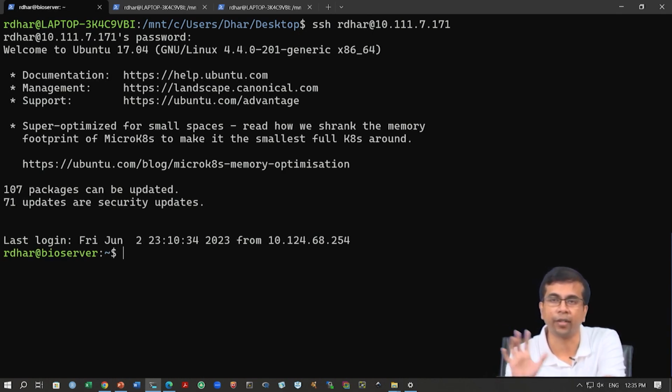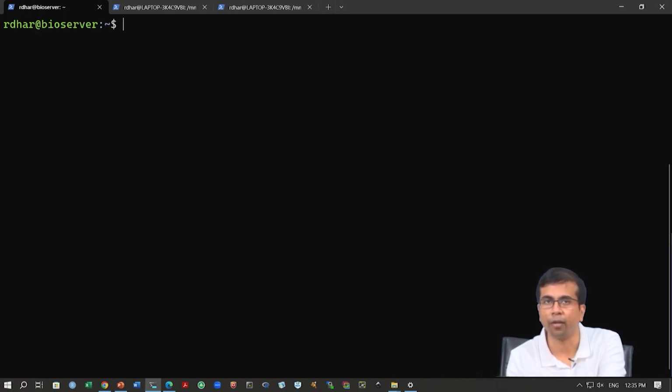This is a server that is running somewhere, running this Linux platform. It shows it is running Ubuntu 17, and we can do a lot of complex computational tasks on this server because of the RAM and the storage that the server has. For those of you who want to do this analysis a lot, for huge data sets, you would like to set up this pipeline on a computational server. So, this is how you access remote servers, and then you can do a lot of things. We will talk about this later on.